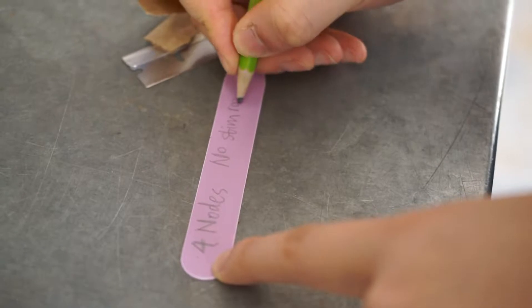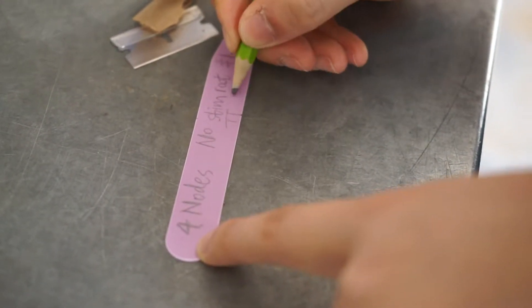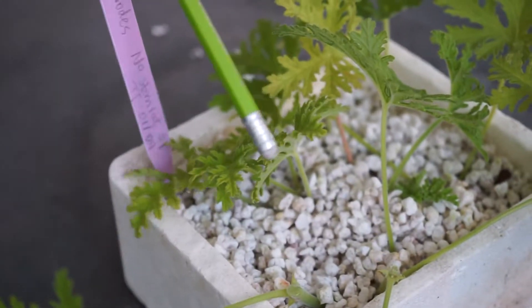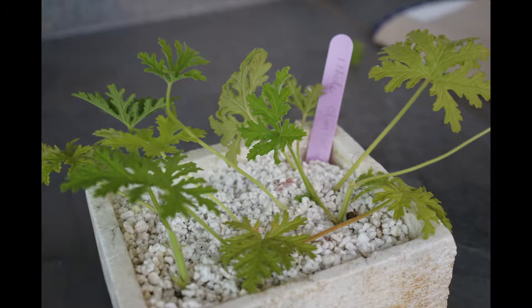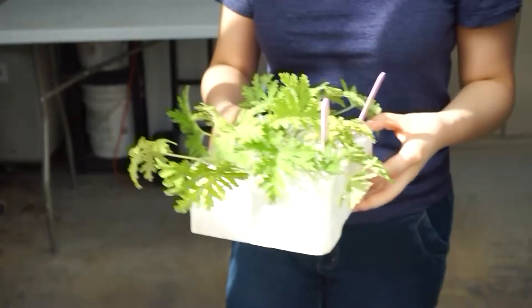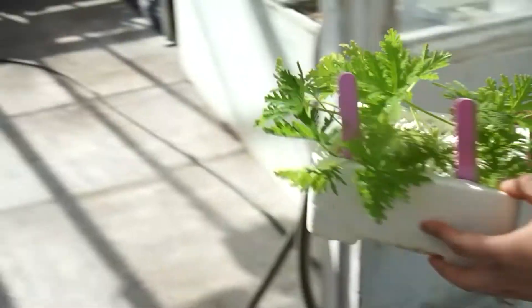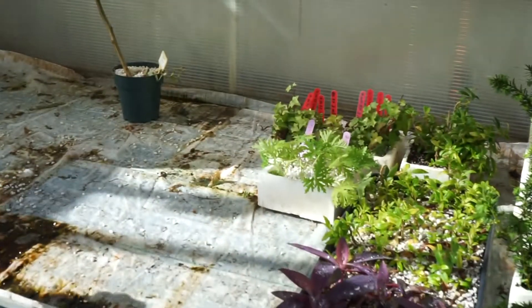Mark the label with number of nodes, treatment, name, and date, then insert the label in the perlite. Plant all other cuttings in the same manner. 1-node and 2-node cuttings were planted in the same box to optimize space. Send all cuttings to the mist frame with bottom heat. The result is observed after 6 weeks.